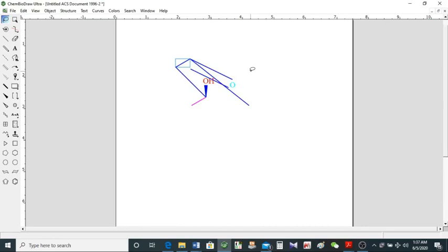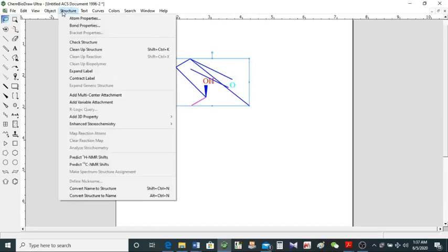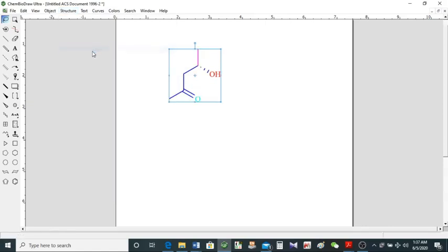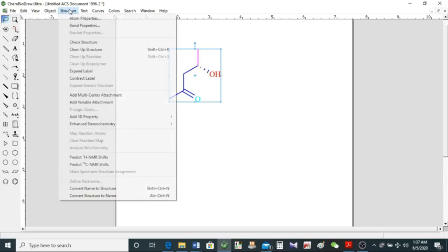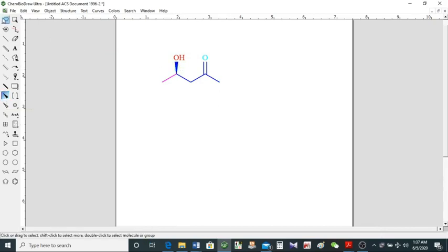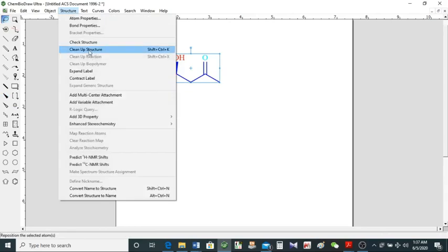I've destroyed the structure — don't worry, I've got it covered. Just double-click on it to select it, then go to Structure and clean it up. Here it is, it's cleaned up. If you don't like it, click it once more and clean it up again. The stereochemistry was inverted, so click the wedge bond again and change it — we have the structure back. If you drag it and make it messy, just come here and clean it up.